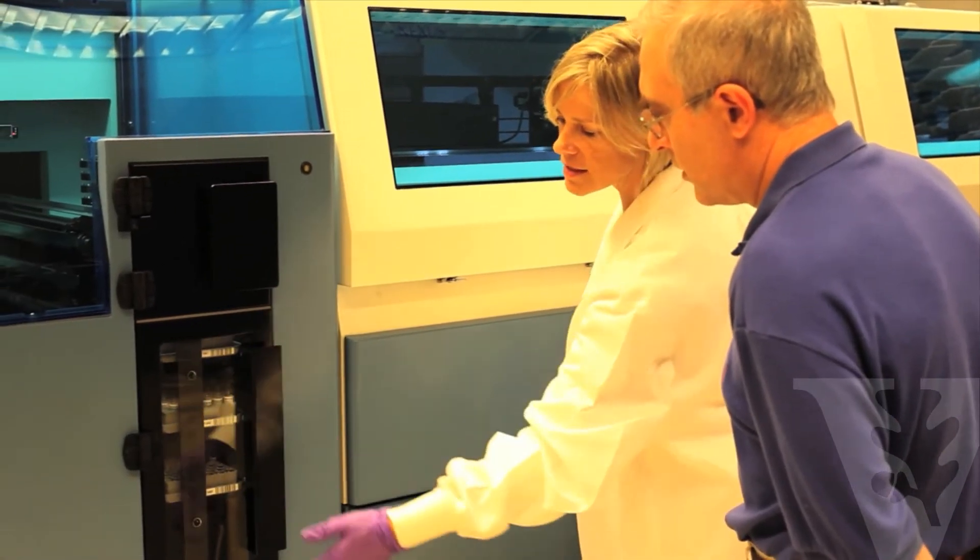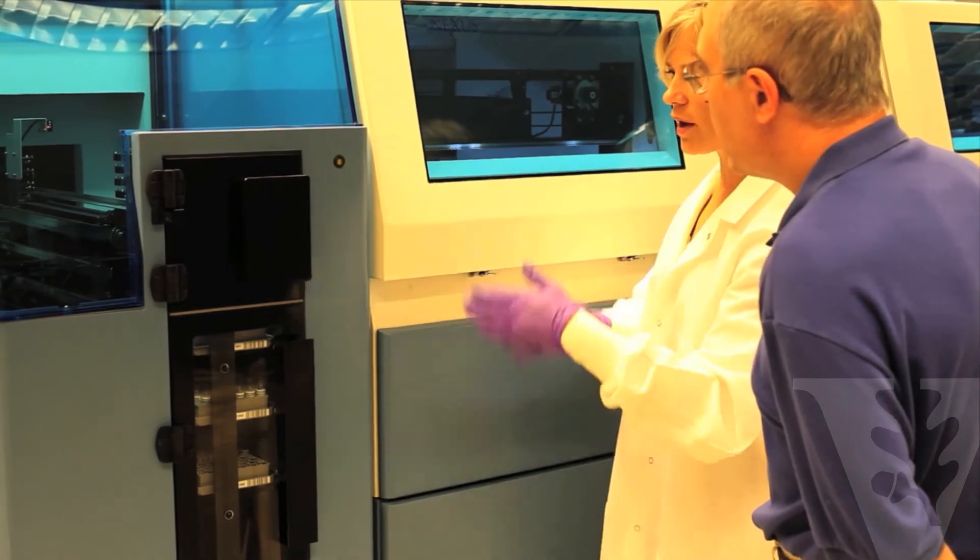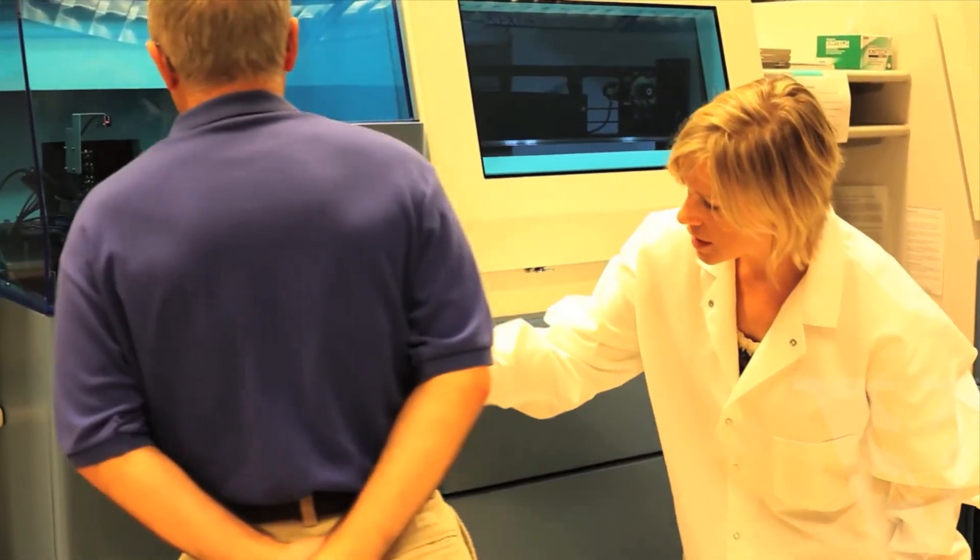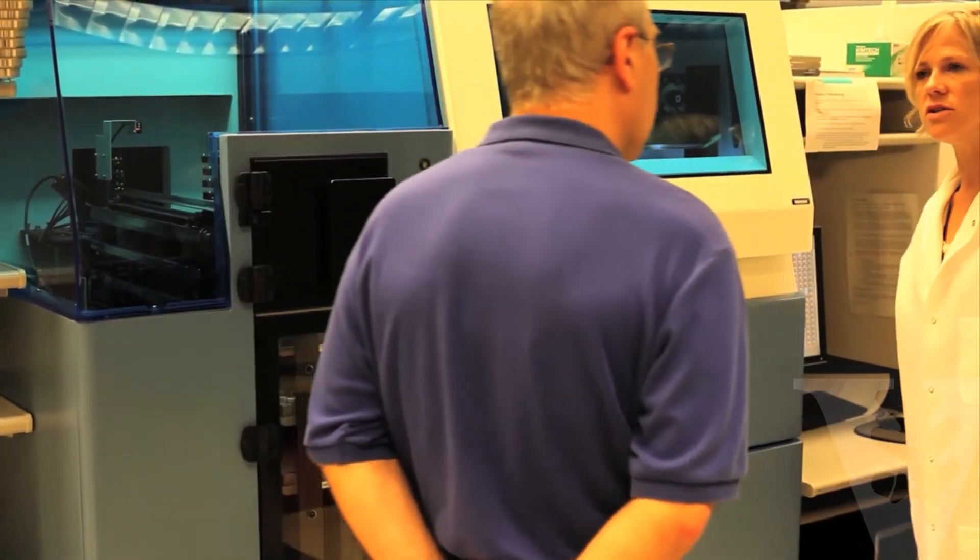We have a full-service compound management group who maintain our libraries as well as provide new compound registrations and distributions.